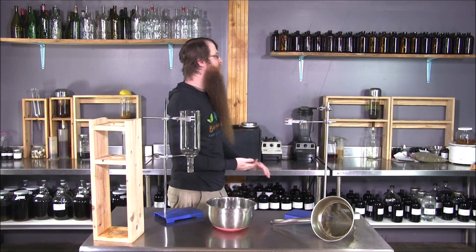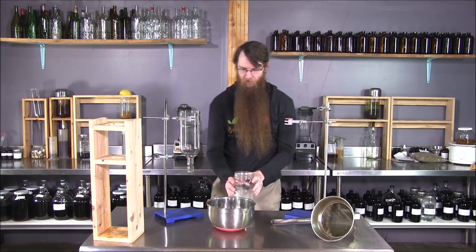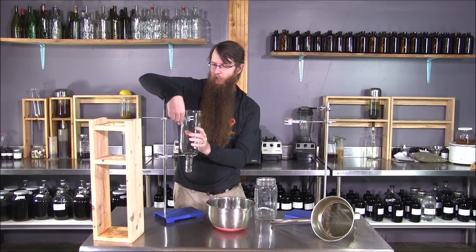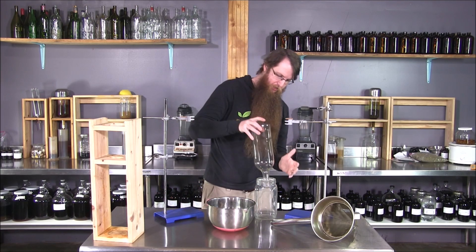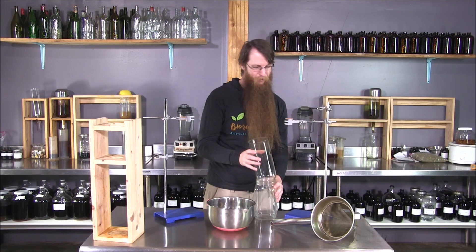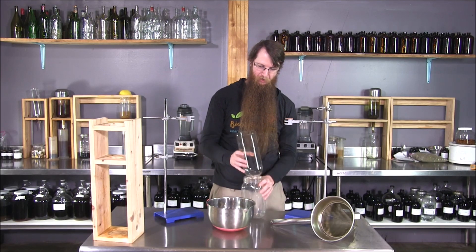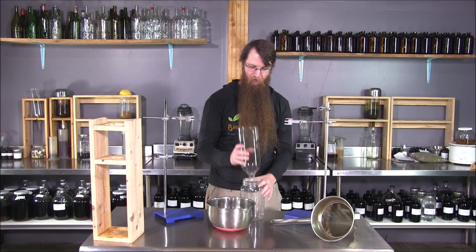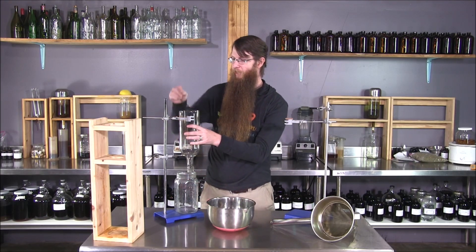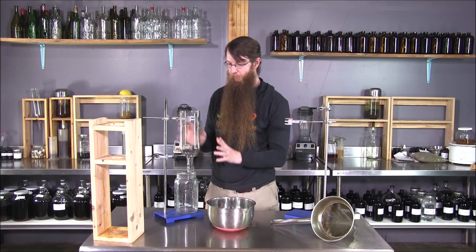You can also use a jar — that's what a lot of people do. They might just take the jar that they're going to be dripping their percolation into and set that in it. But then it's probably not going to tip over, but if it got bumped it might. You can put a rubber band around it to make it a little more steady. But honestly, for $30, an extra set of hands is very handy for doing percolations.